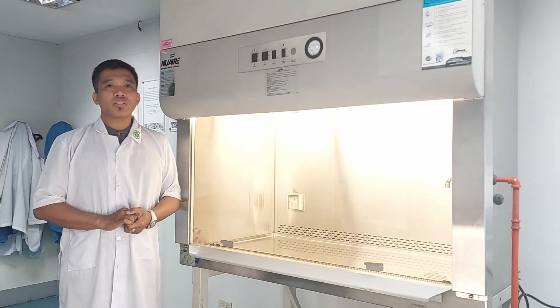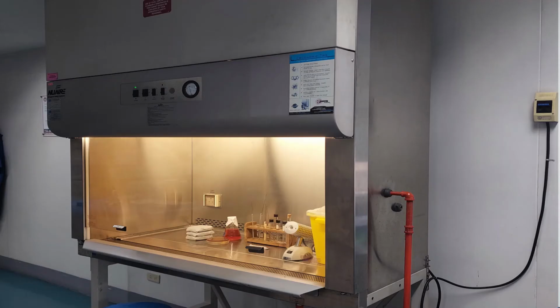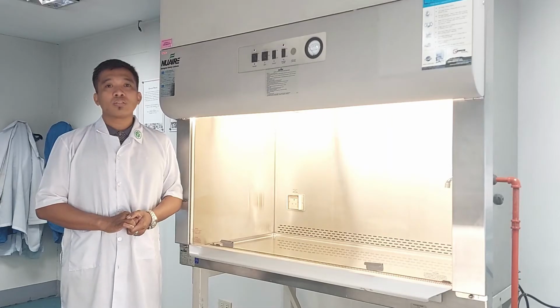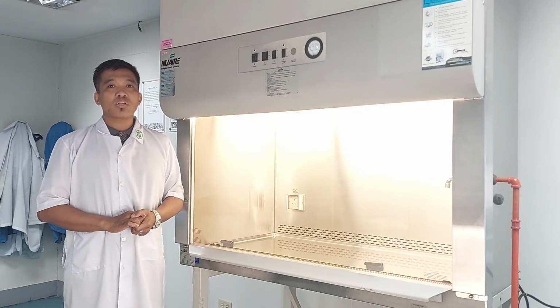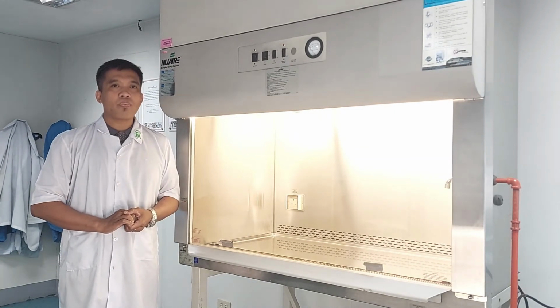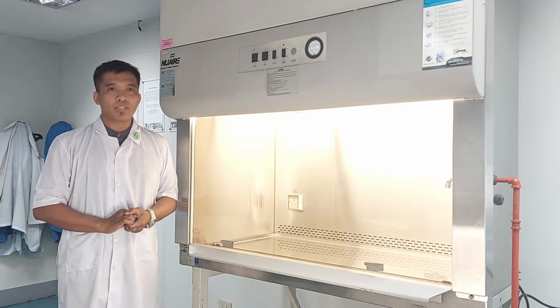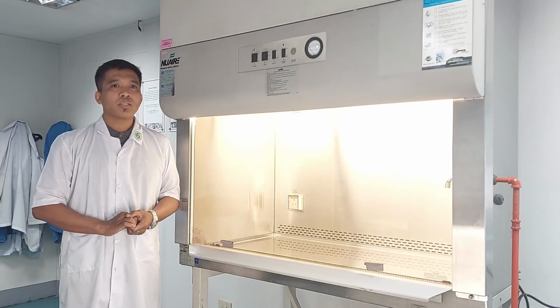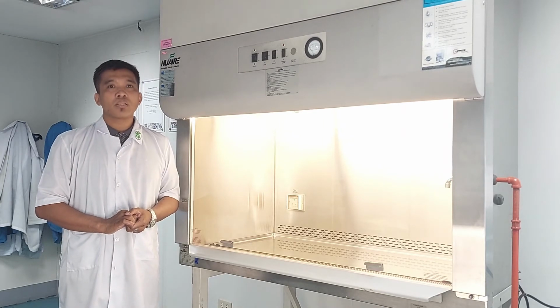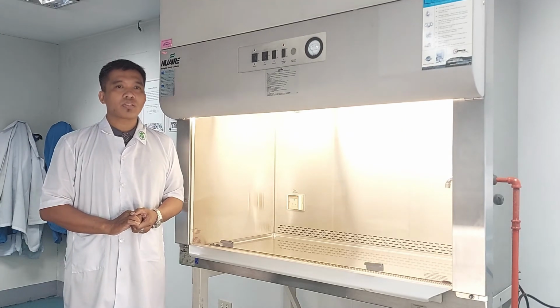Proper cabinet location is critical. External airflow disturbances such as doors, excessive human traffic, windows, diffusers, and air conditioner outlets can compromise containment. Always operate the unit continuously to maintain the airflow barrier and prevent contaminants from escaping. Minimize disturbances to the airflow barrier. Work in a controlled and steady manner, avoiding rapid movements.